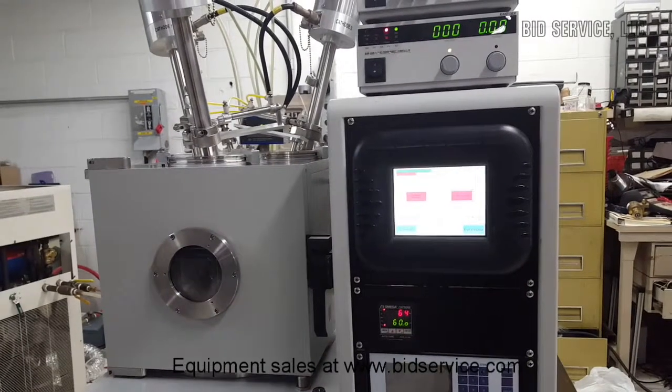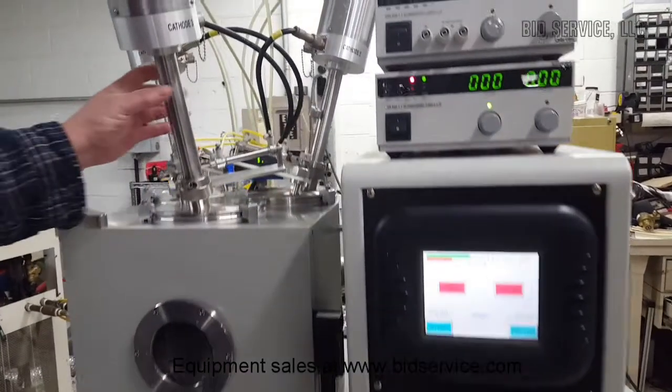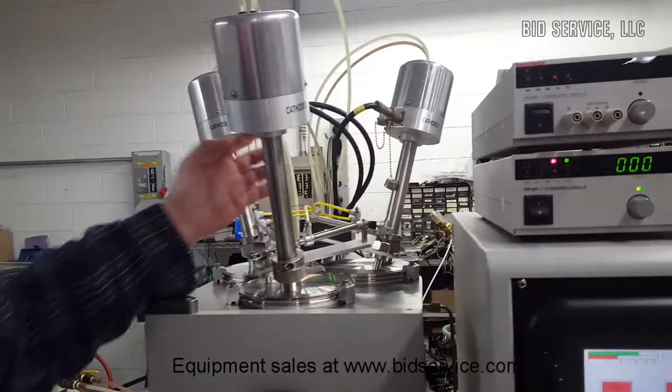The next demo here is for the Denton Explorer 14 sputter. This has three cathodes to it. Here's your three cathodes — you've got cathode 1, cathode 2, and cathode 3.